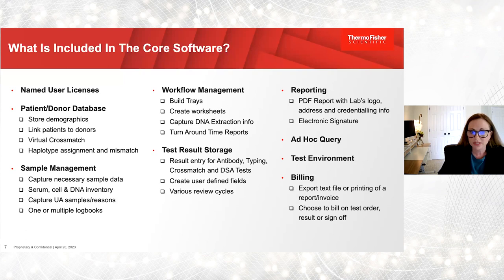So this is where you're able to store the demographics of patients and link them to donors via cases, and I'll show you that in a little bit. You're able to put serum and cells into an inventory, into a box location, so you'll have an electronic version. You're able to mark samples out as unacceptable, so this becomes important. You'll want to capture all the samples you're receiving, and then at the end of a certain term, you'll be able to generate an unacceptable report to go back. Maybe you'll have a dialysis unit problem, and you'd be able to use this unacceptable sample feature to help diagnose it.